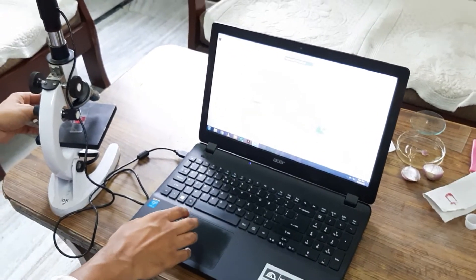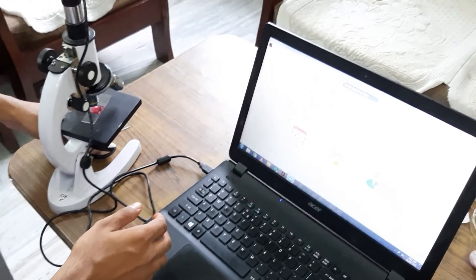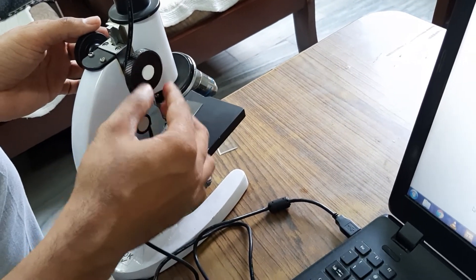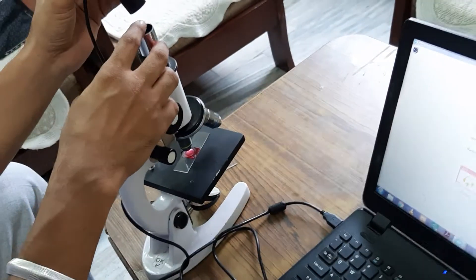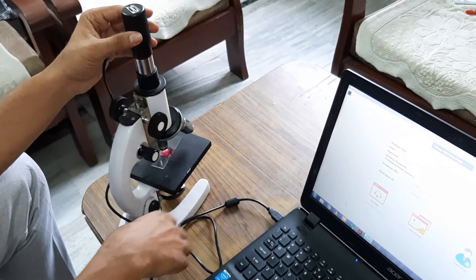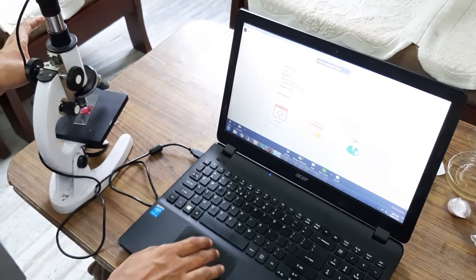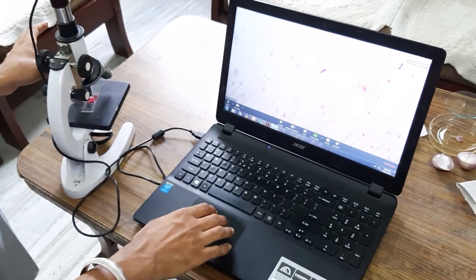Here is the microscope — you should know about its parts. There is a reflecting mirror to focus light on the material, ocular lenses, and major and minor focus knobs to adjust the material. I am using a digital camera connected to my laptop instead of the eyepiece. I have focused my material and will now show you.